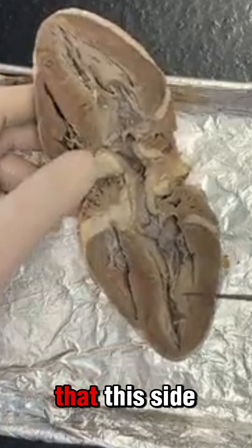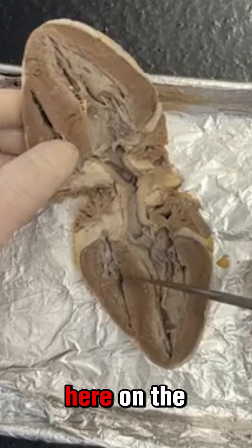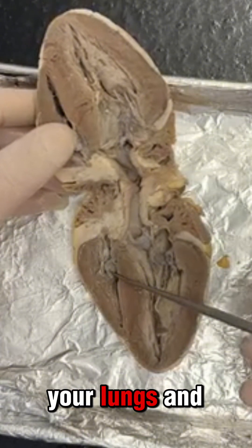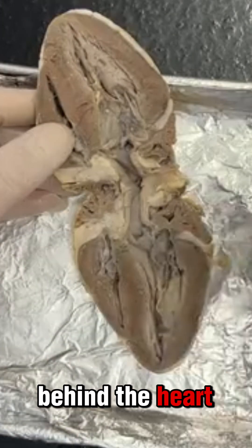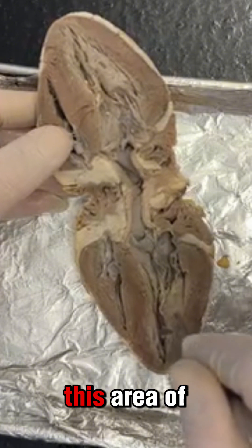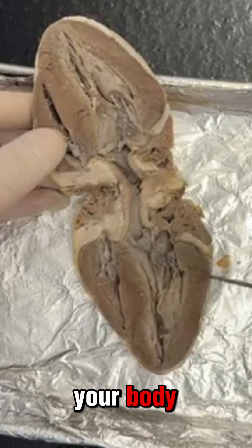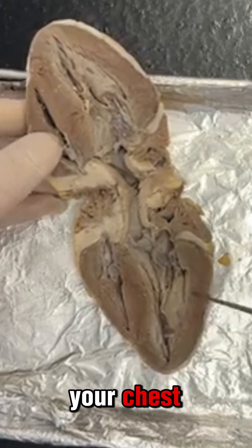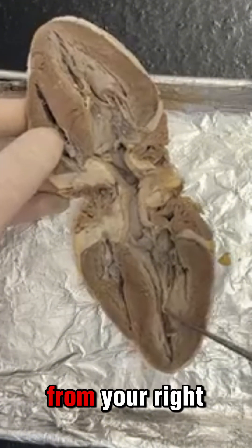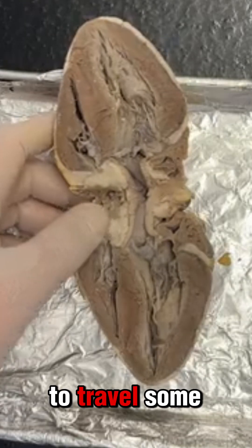Now it's important that this side of the heart has a bigger muscle than this side. On the right side, blood only needs to flow to your lungs, and your lungs are close by — right behind the heart on both sides. Whereas the left side of the heart is responsible for fueling oxygen to the rest of your body. The heart has to be able to pump all the blood from your left ventricle all throughout your body, so it's a lot longer way to travel.